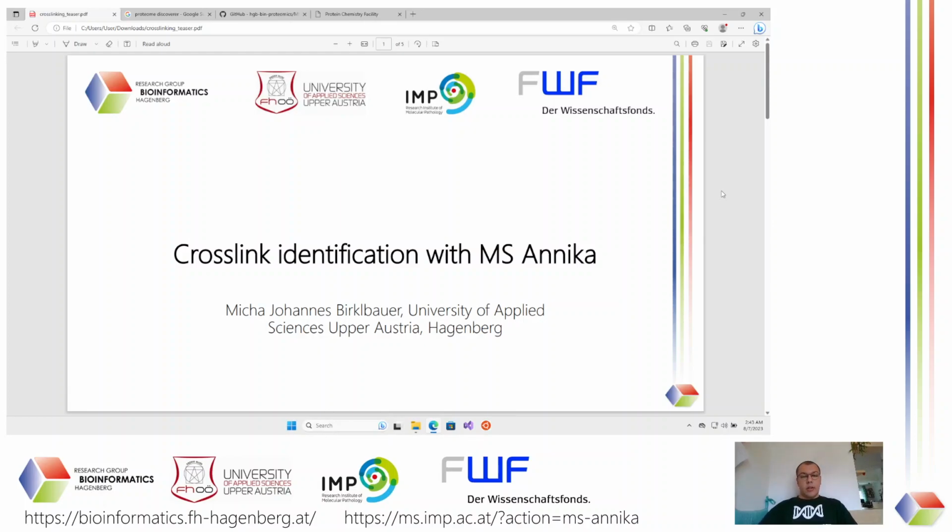So this tutorial will basically go over all the steps from downloading Proteome Discoverer, which you will need for MS Annika, to installing Proteome Discoverer, installing the MS Annika node, which you then will use within Proteome Discoverer, and going through an exemplary workflow with the crosslinker DSSO, where we have some example data that I will use and which should be pretty much applicable to any cross-linking workflow that you're going to use in the future.